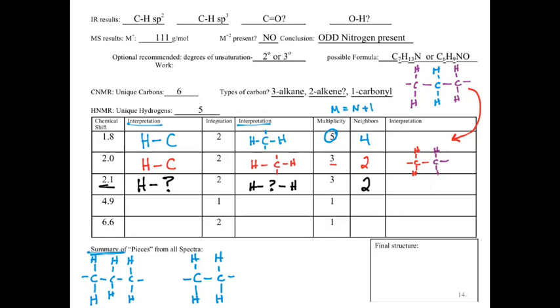I'm going to try and zoom in. Whoops. We have a hydrogen bound to carbon, and we know that because if it was a nitrogen or oxygen, it would hide those hydrogens from other hydrogens, so we wouldn't have any neighbors. So at this point, we now know that that has to be a carbon. Okay. Again, two hydrogen neighbors, so we're running into the same situation that we had before, and we'll come to the exact same conclusion, that it has to be a CH2. Okay. We can't do two 1CHs.